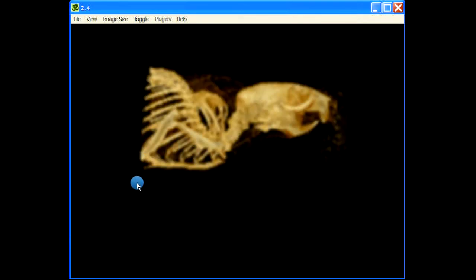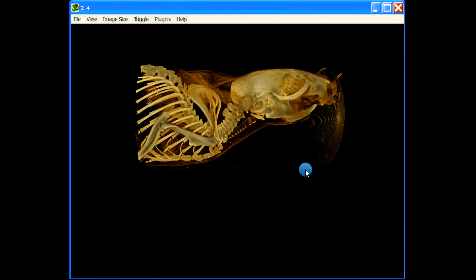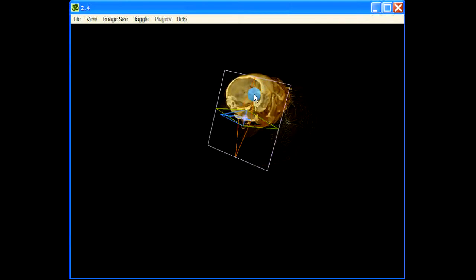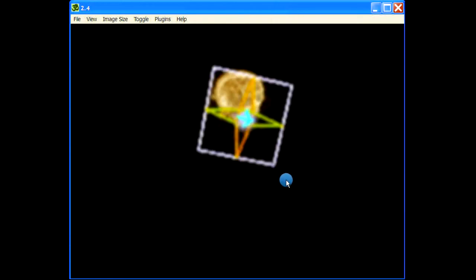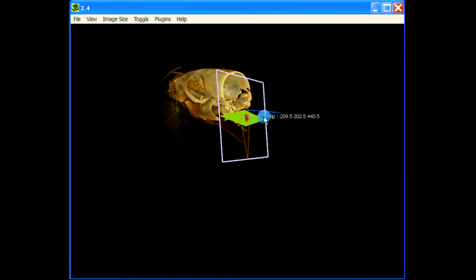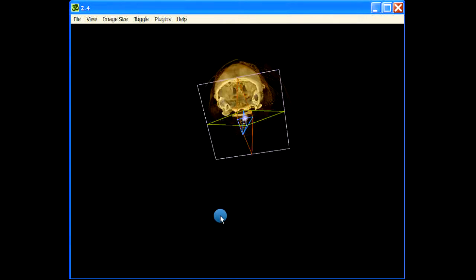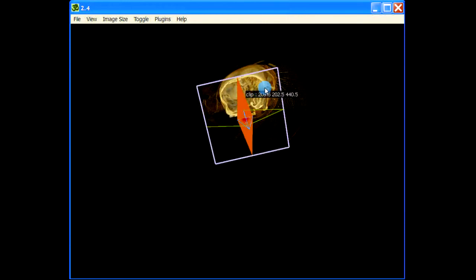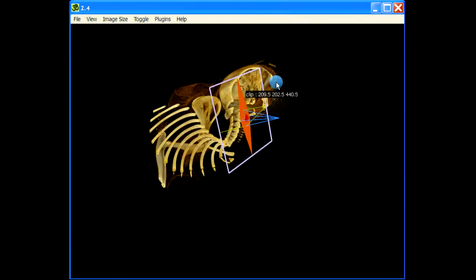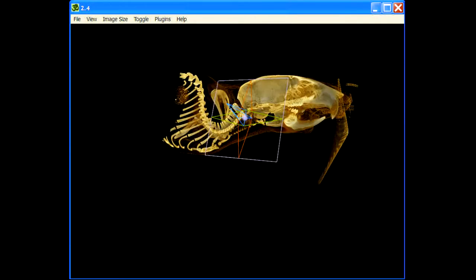In a similar fashion, we can have a viewport for the paths. So let's start the path. Now, what the path will give you is that you can use path to, say, straighten your data. So let me explain that by showing you what I mean by straightening the data.